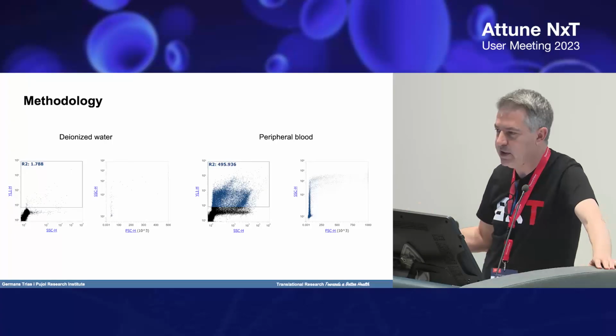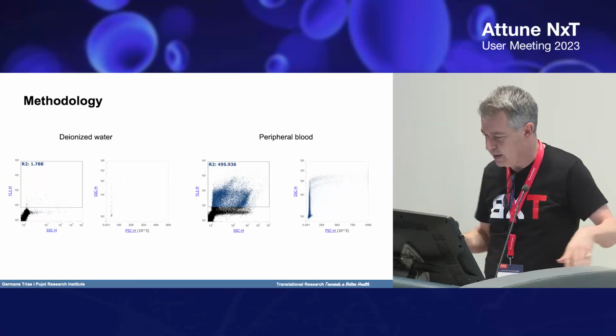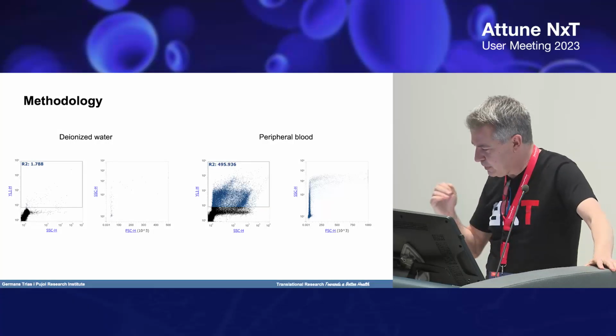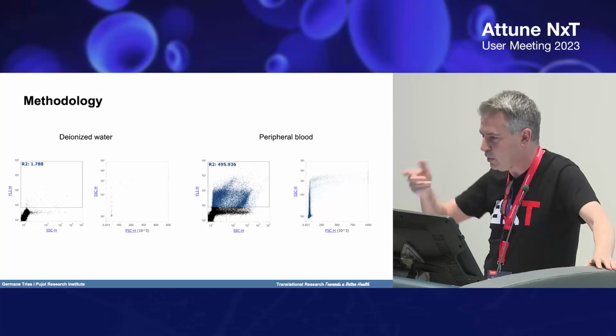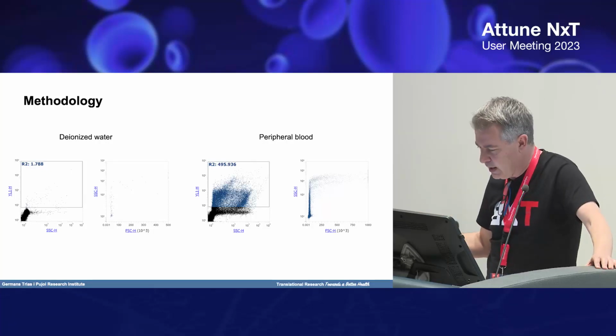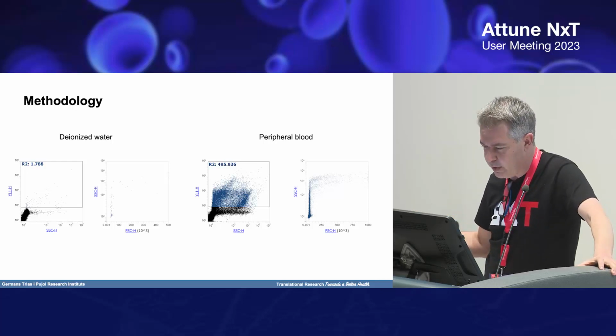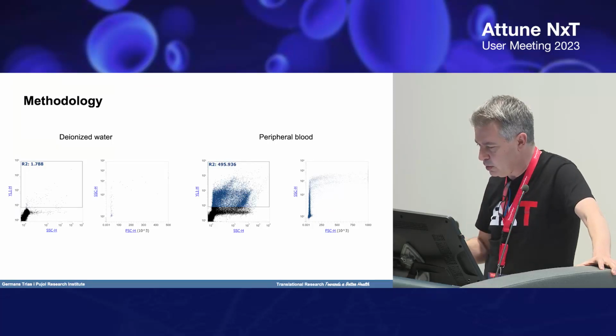This is especially critical on Monday, which is the most difficult day, because we need to run a lot of water just to start the experiments, and we need to monitor this presence, because we are also always diluting our samples using deionized water. That's the main reason we should control this continuously.